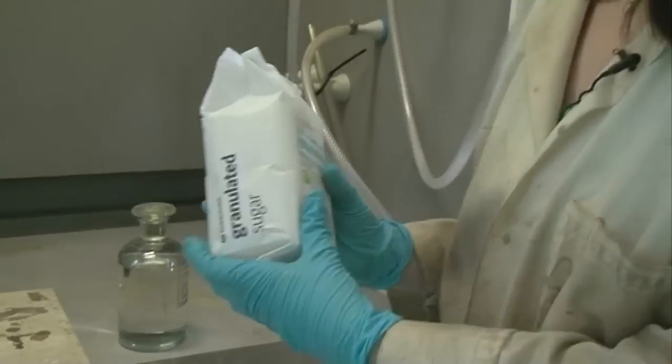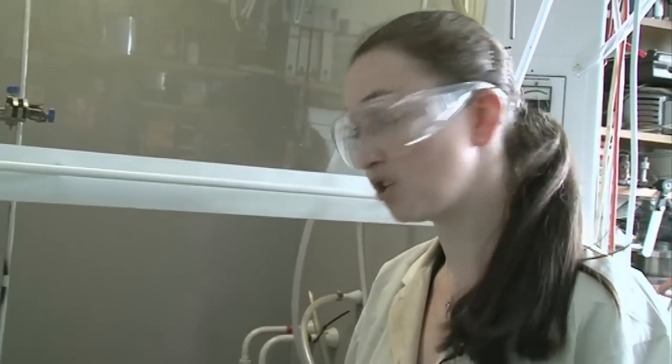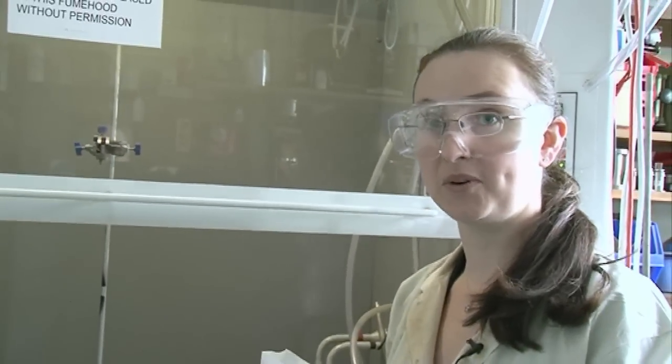So here we have some sugar, common or garden supermarket sugar. And we're going to put some sugar into this beaker, add some sulfuric acid and see what happens.